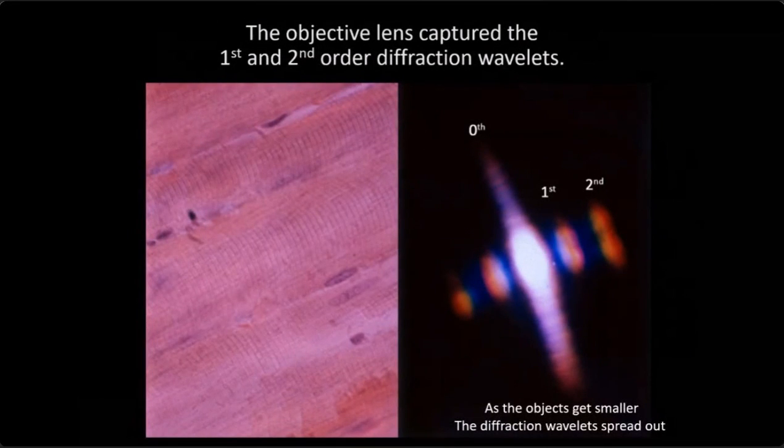Now you see the muscle cells, they call them striated muscle. That's because they have stripes. And those stripes have a regular distance to them. So if you look at that picture in your microscope, and I encourage you all to do this when you get back to your lab, find a preparation of muscle where you can see the striations.